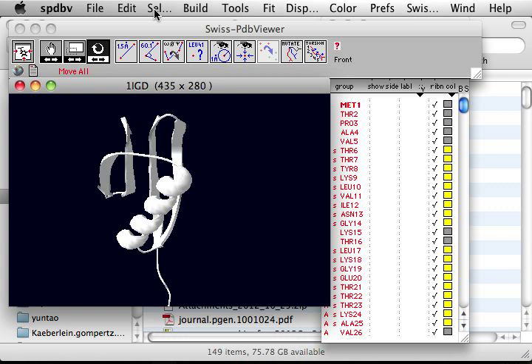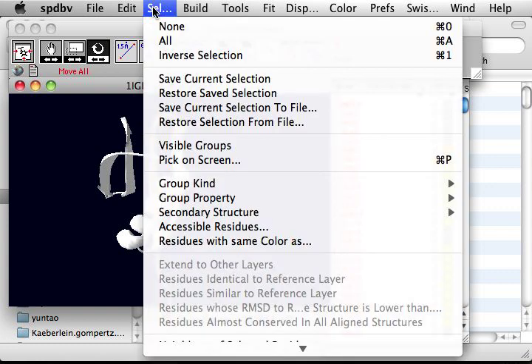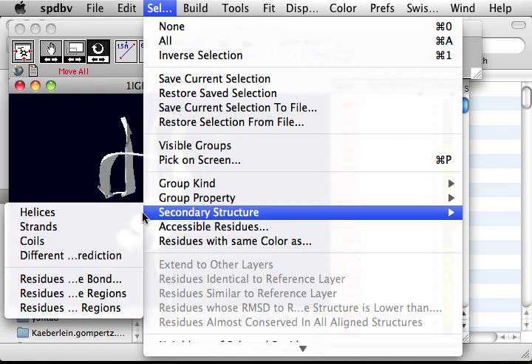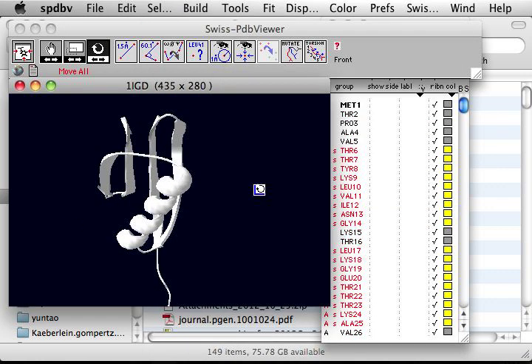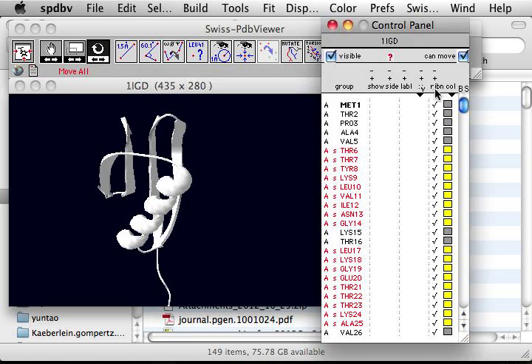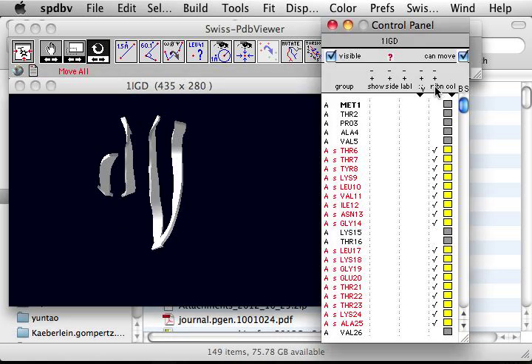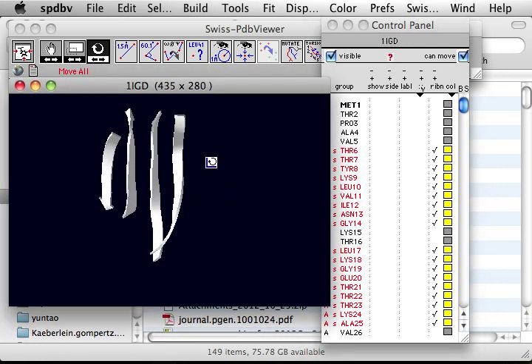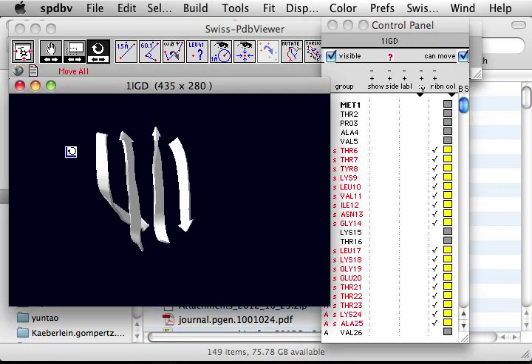So we can now say, what if I only want to see the beta sheets? So I can say select secondary structure strand, also beta sheet. And then I click the ribbon again. So now only the beta sheets are showing.